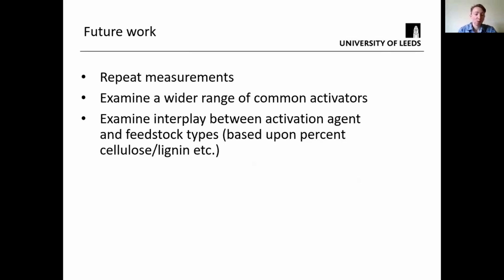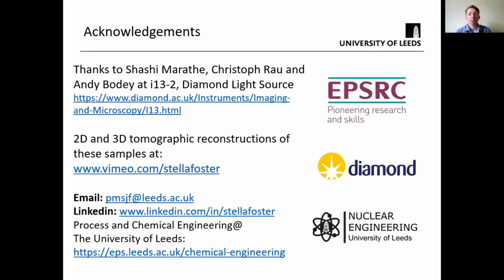I need to do some repeat measurements to ensure that these samples are repeatable. And I'd like to examine a wider range of common activators, of course, and then also examine the interplay between different biomass feedstock types with the activating agent. And that's me finished, if there are any questions.